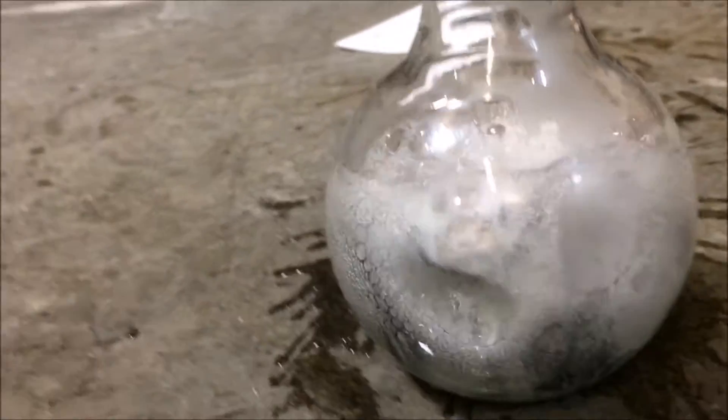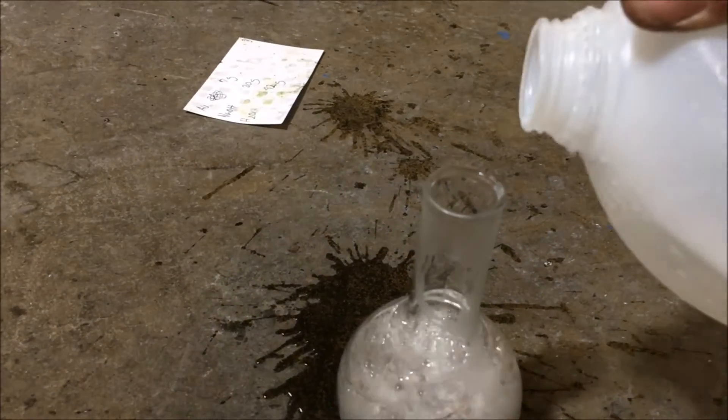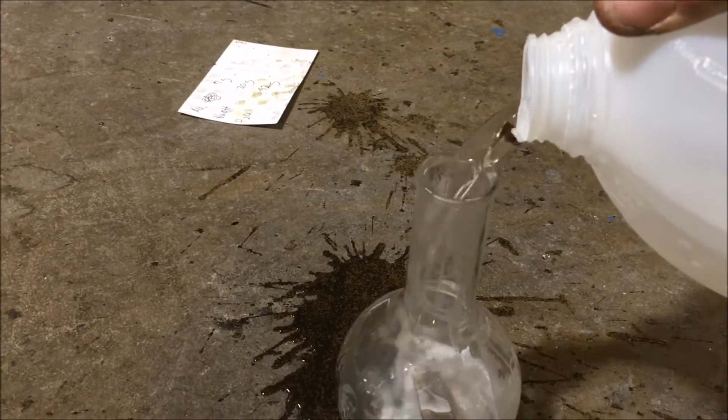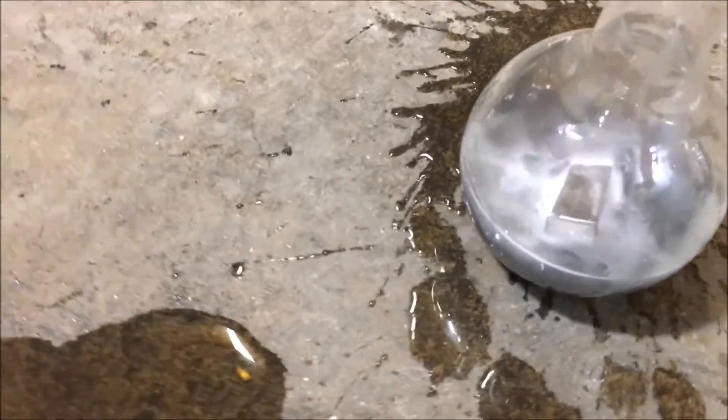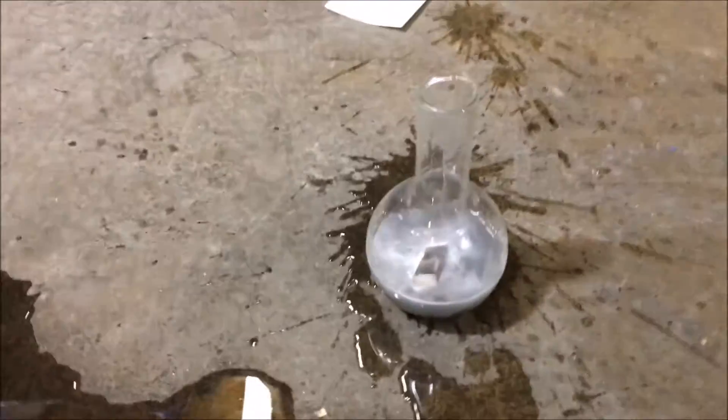There's a lot of hydrogen gas being released in here and there's hardly any electrolyte left. Cooling it down — that was a near-miss incident there.